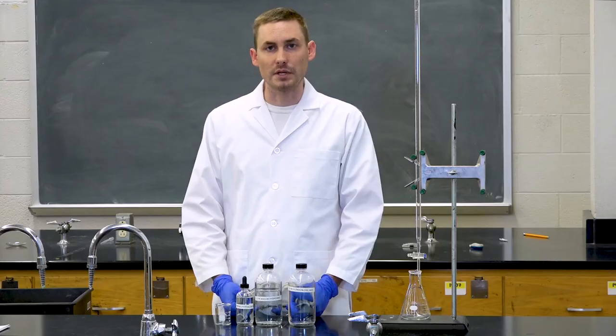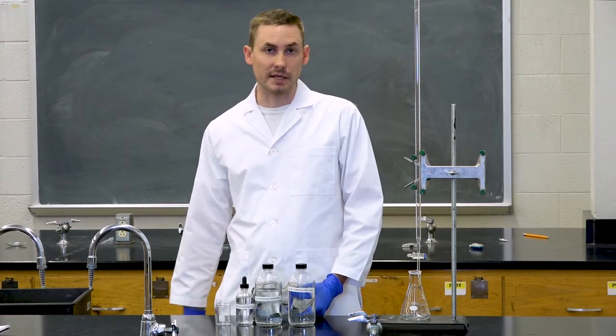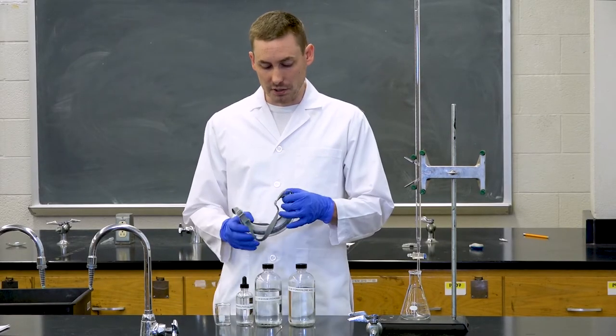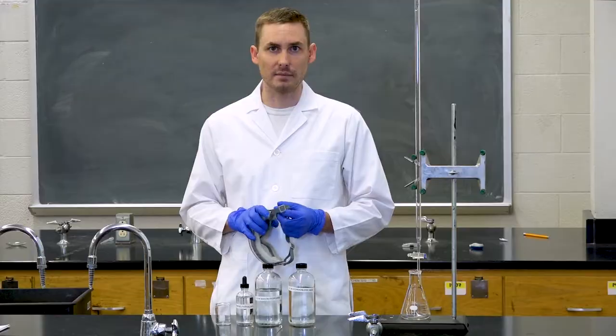Before we start the experiment, we need to remember lab safety protocol. We need to make sure that we're wearing a lab coat that is buttoned all the way up with no skin showing below the waist. That includes pants that extend all the way down to the shoes and closed-toed shoes as well. Please remember not to have your ankle showing in the lab. We also need to wear goggles, gloves, and have any loose hair tied back so as not to interfere with the experiment. Please also remember not to smell or taste any of the chemicals in the lab, and please do not eat food or drink any water in the lab as well.